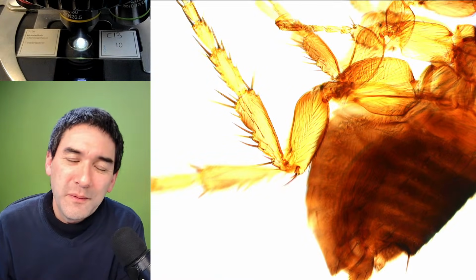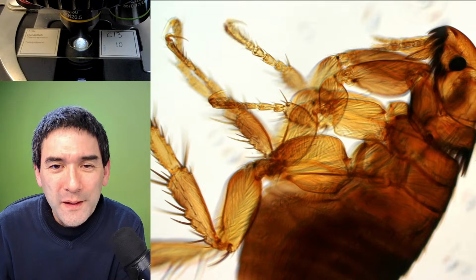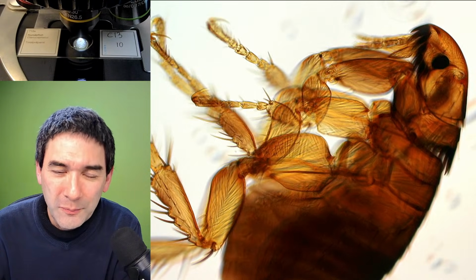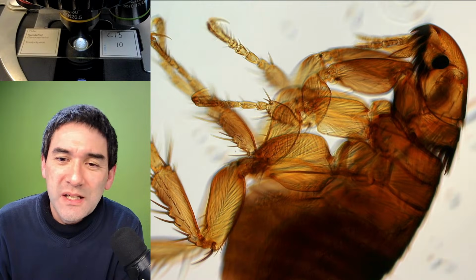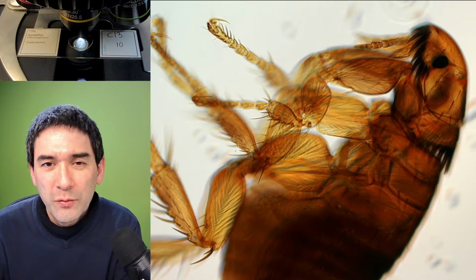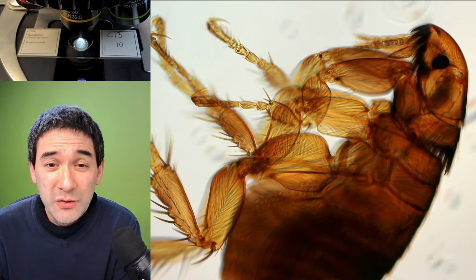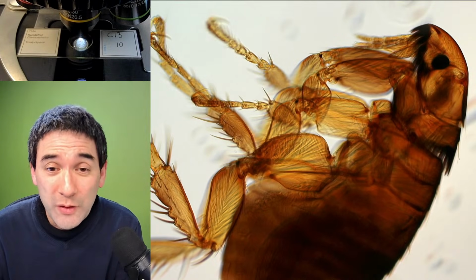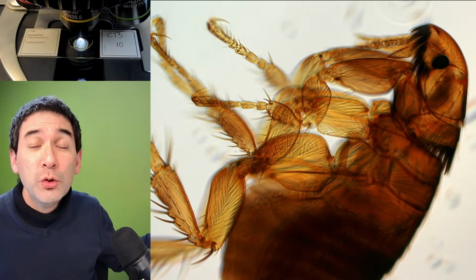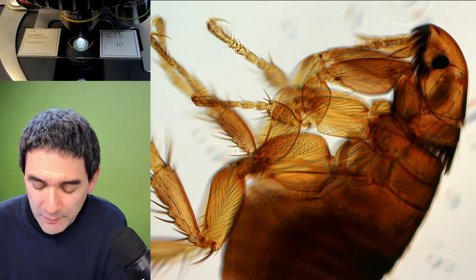Usually, those whole-mount slides are not so difficult to make, really. But the problem with them, as always, is that in many cases the specimen is too dark. It won't allow any light to go through, and then you don't see any details. So in many cases, those insects have to be bleached a little bit. There are a variety of ways to do that. Potassium hydroxide, for example, is quite common. You can apparently also use lactic acid to bleach them, though I never tried that. And then some mounting media, like for example Euparal, are also suitable for brightening them up and clearing them.